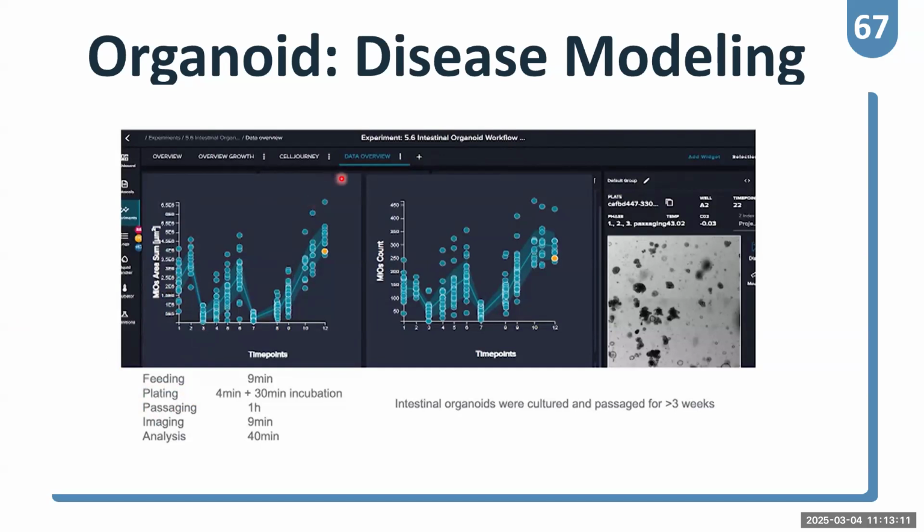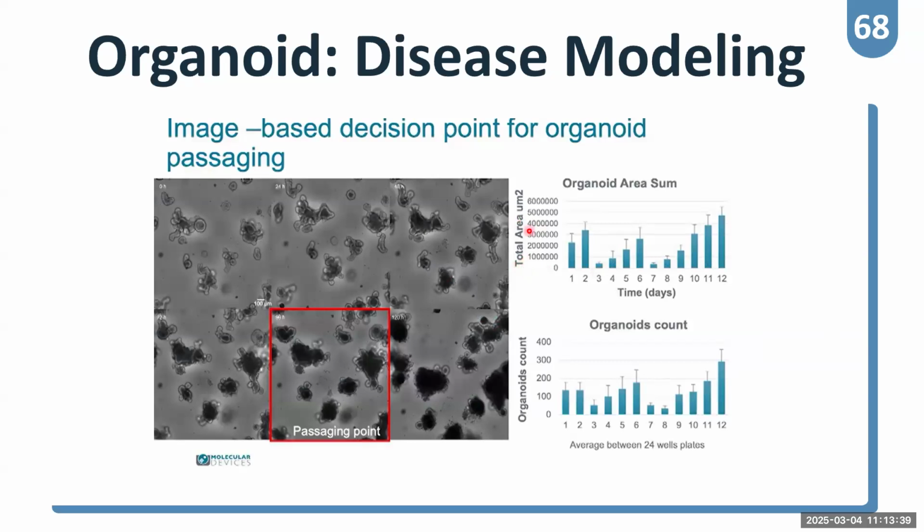They can report in real time, and you can report a stable monitoring time for this patient's organoid, for example the culture period of 5 days for one doubling time. You can also see total area and organoid number reported for one machine.